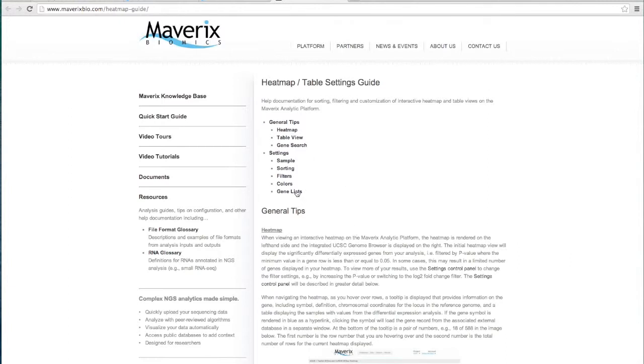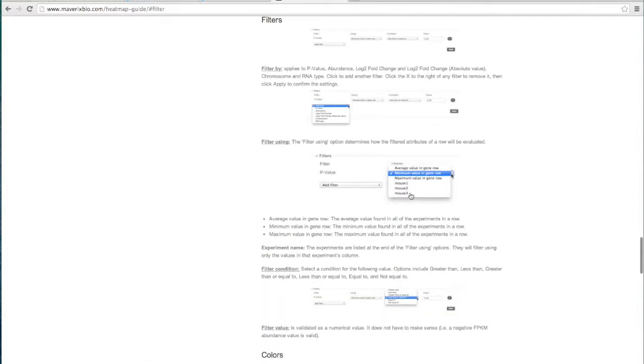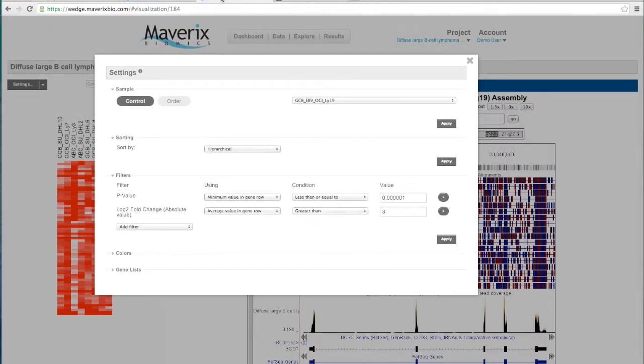In this case, you could jump over and take a look at how to filter your heat map, and the same is true for the configuration. It'll give you some tips on what sort of values are expected during the configuration when you're trying to set that up for your analysis.